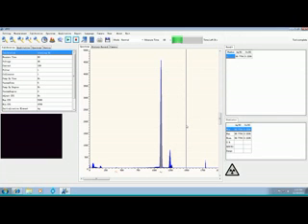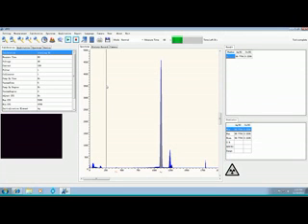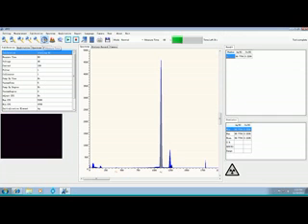So I have a new operator, he's going to go up and the first thing we want to do is we want to set our measuring time. That was this, right? Yep, this is the clock right here.